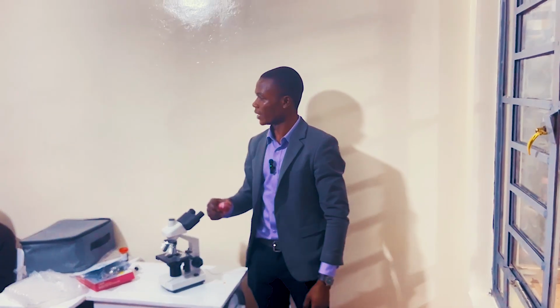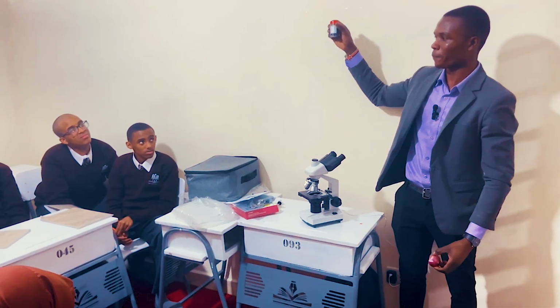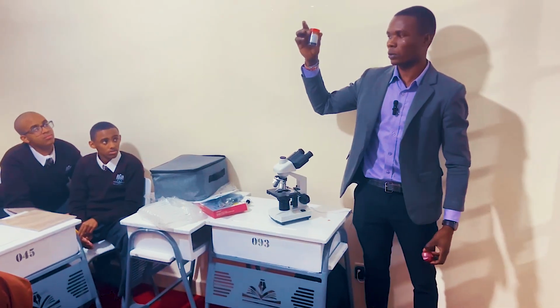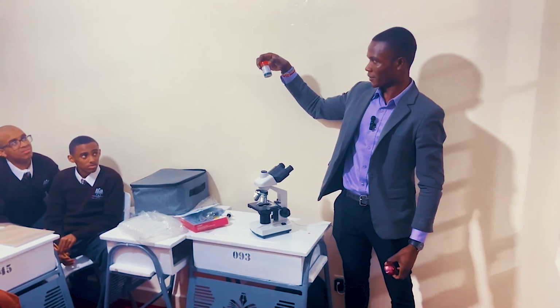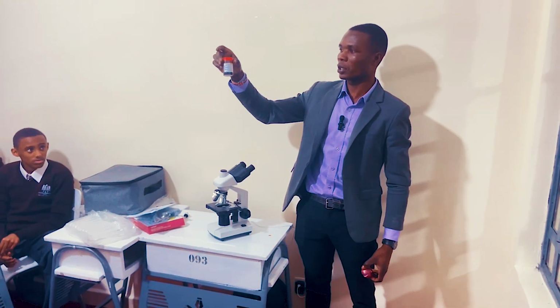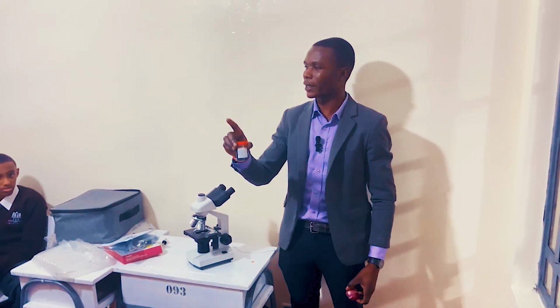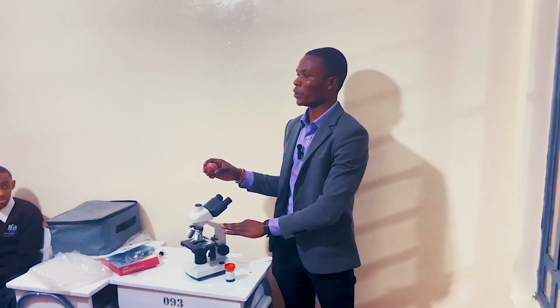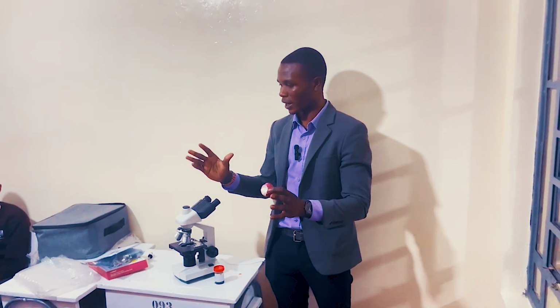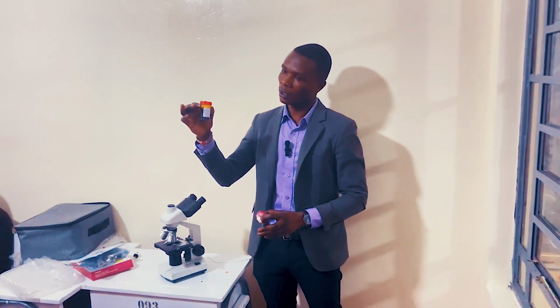So what is staining? Adding drops of, you cannot use water. This solution here is called iodine solution. Iodine solution. It's not blood. This solution is what we are going to use to stain. Why do we do staining? To make it appear what? Clearer. So if you have thinned it and we want to view it, you are going to see some parts, right? Now for you to make the parts clearer, you are going to stain it. So you are going to add drops of iodine solution.